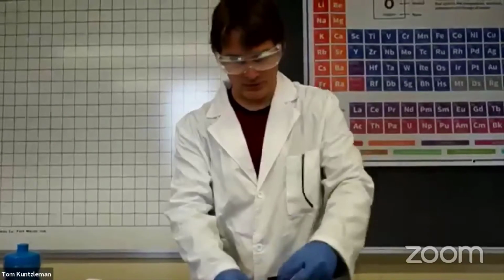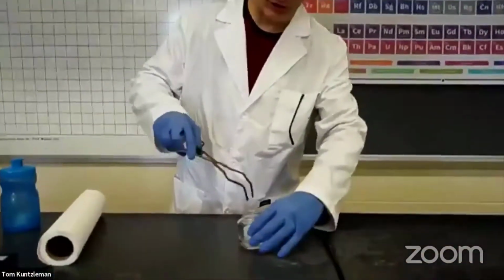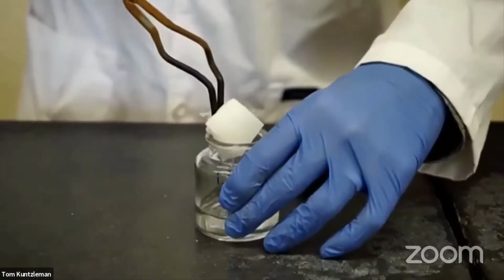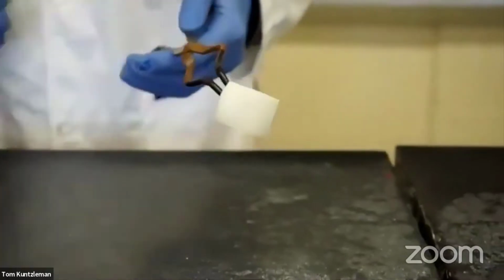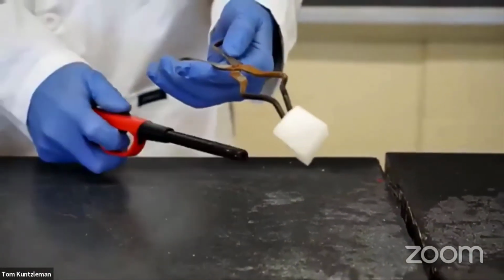And what you do is you take that compound and you basically light it on fire, because it's a flame test. And so what I'm going to do here is take this particular sponge. It's been soaked in some alcohol, and it's also been soaked in a salt. So there's a salt that's been dissolved in the alcohol as well. And I'm going to light this flame, and we're going to see what we see. Let's see.